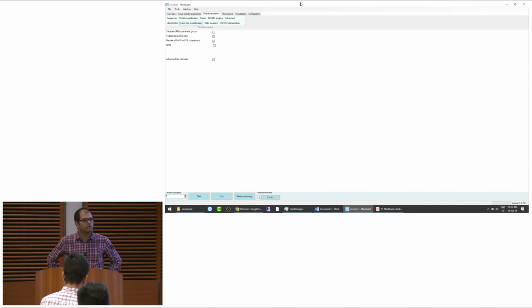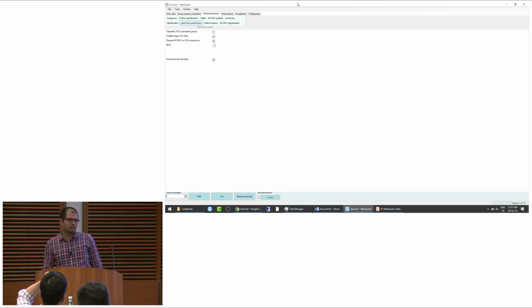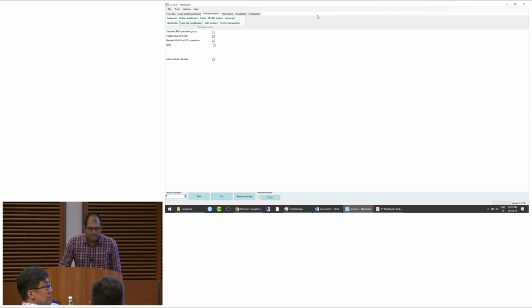If I use two different sequence databases, not the database, but two species, like one is Homo sapiens and one is something else, the protein group table still shows one table, and the FDR is calculated based on both sequences together? I think there should be a split protein groups by taxonomy option. Yeah, the FDR is calculated together, but then there is an option. Is it in the public version?